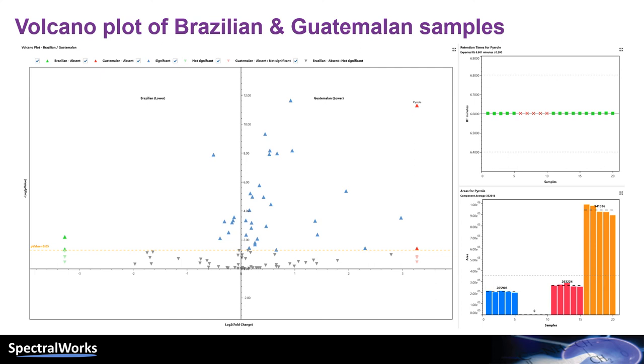The Volcano plot allows us to quickly see the significance and variation in the components between two particular groups of samples. Every component above the orange p-value line is considered significant. The green components to the left are absent in the Brazilian samples and the red ones to the right are absent in the Guatemalan samples.